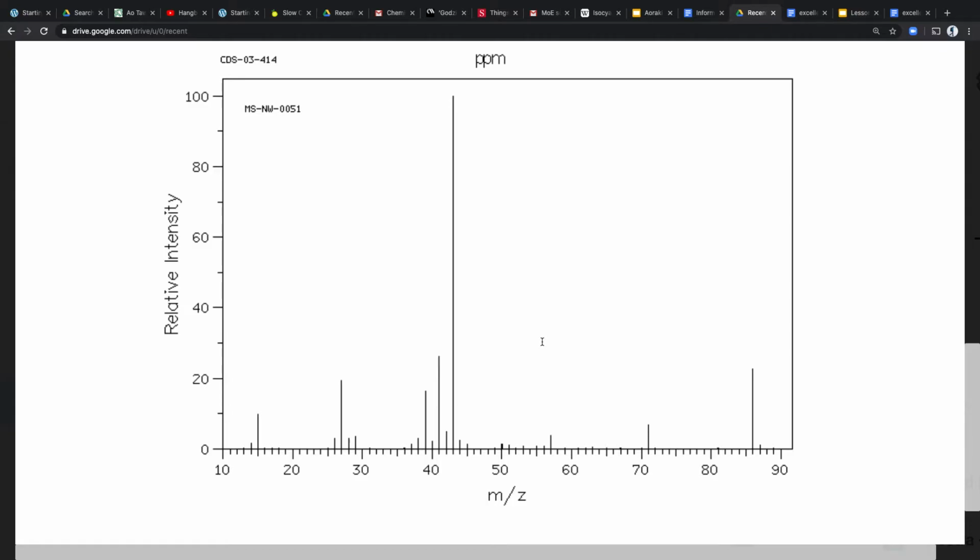The other things we want to do in our justification report is explain what the fragments are that produce some notable peaks. Like the base peak should always be one that you explain in your report, in terms of what the structure of the fragment was that matches up with a base peak of a mass of 43, I think here. Yeah, 43. Cool. And maybe 1 or 2 other fragments as well. So I'm looking down at 15. 15 always tells me it's a methyl group, so a methyl group has fallen off the molecule. There's one at like 27. We could maybe figure out that one. And that's about it.